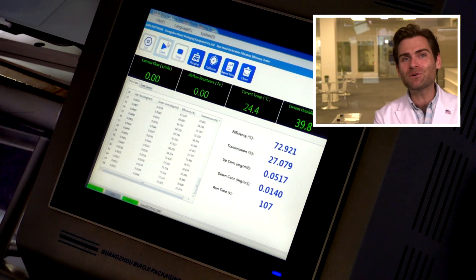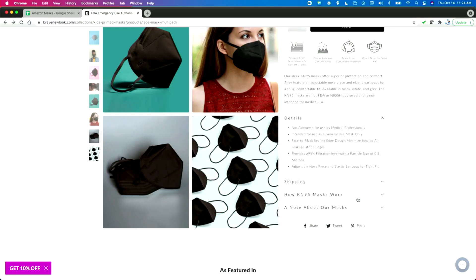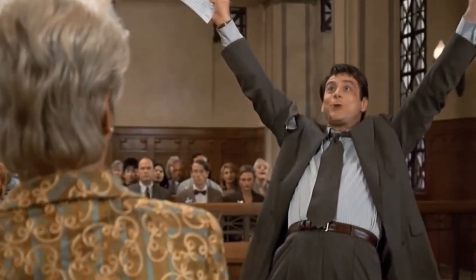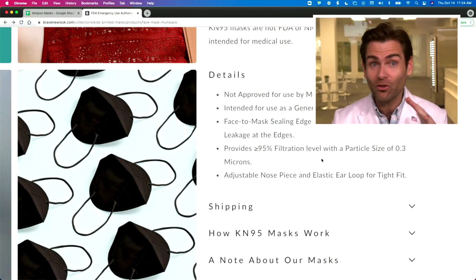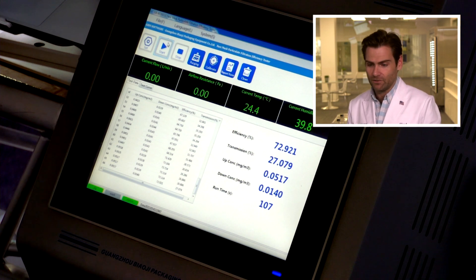They're making the claim it's going to protect you with 95% filtration — so do you think they might be lying about product quality too? That's what this machine is here to test. The result: 72.92%. Their website claims 95% filtration at 0.3 microns, and that's exactly what this machine tests. The truth shall set you free — and they failed.